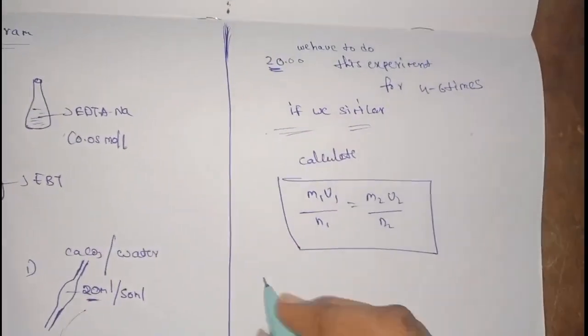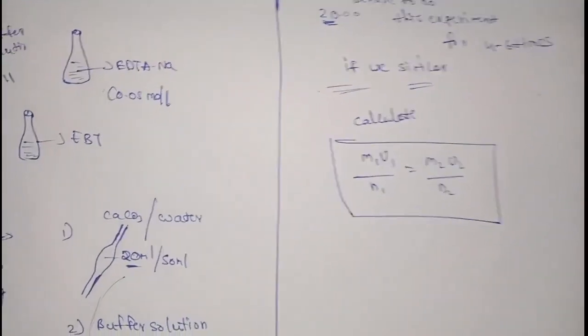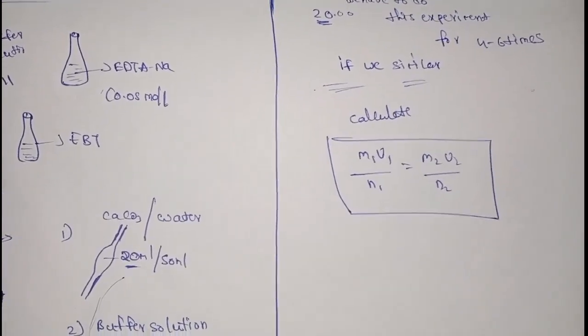Likewise we will get the hardness of water.